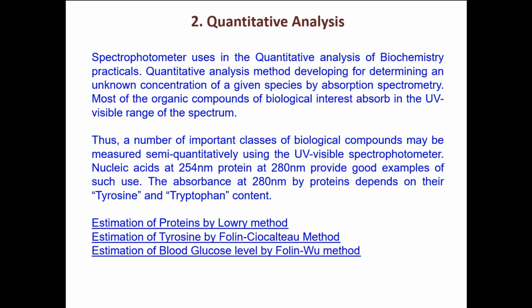and I'll keep it for about 20 seconds. By 20 seconds, gradually there is an increase in the optical density because there is an increase in NADH. Are you clear? When the NADH increases, the optical density automatically increases. So that means the reaction is progressing, enzyme activity is going on, right? Likewise, I'll take the optical density for this reaction three or four times, or even five or six times.